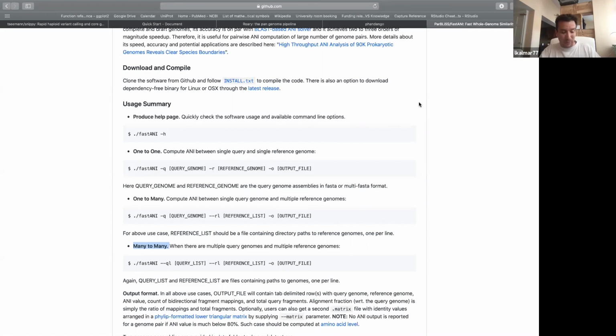If you have very close isolates from the same strain, probably the same source, but different time points or different patients, probably use a very high resolution comparison to find out the exact, the perfect, well-defined distance between them. So use the SNP, a whole genome SNP approach.